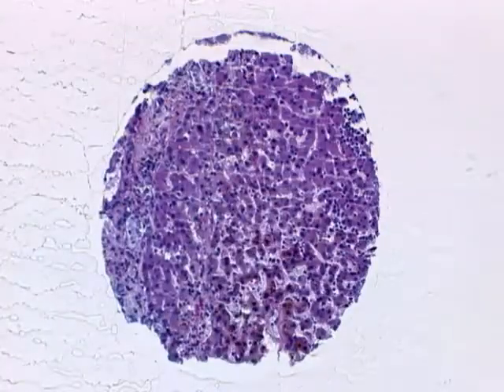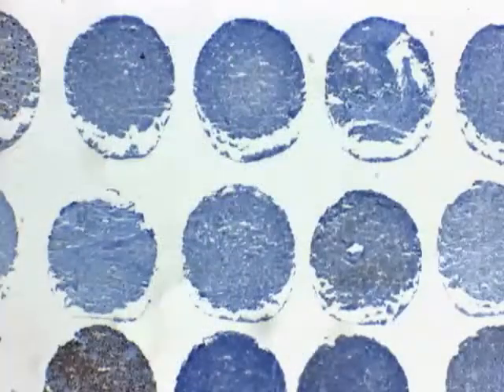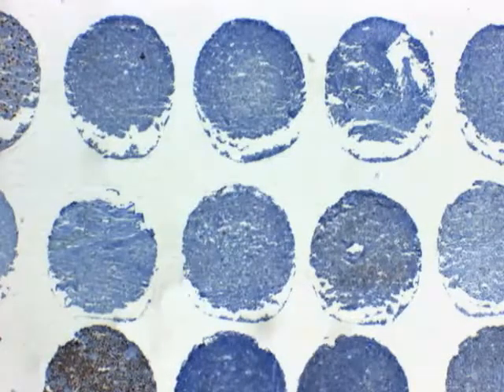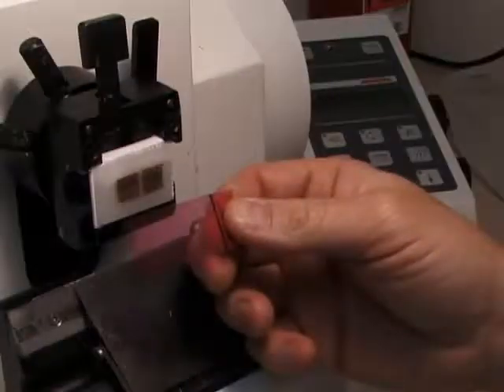To optimize quality in the sectioning aid system, always use a fresh blade after every 3 or 4 sections. If you don't, there is a characteristic that often happens with dull blades using the tape system. The tissue develops a smile-like tear. This is less apparent with a fresh blade.